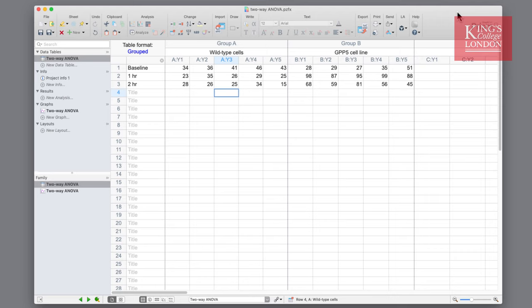An example of this is on the screen. We have two different cell types: wild type in group A and our GPP5 genetically modified cell line in group B, and we expose them to a drug over a period of time. The measurement variable is their viability and the nominal variables are genotype and time. This tests three null hypotheses.